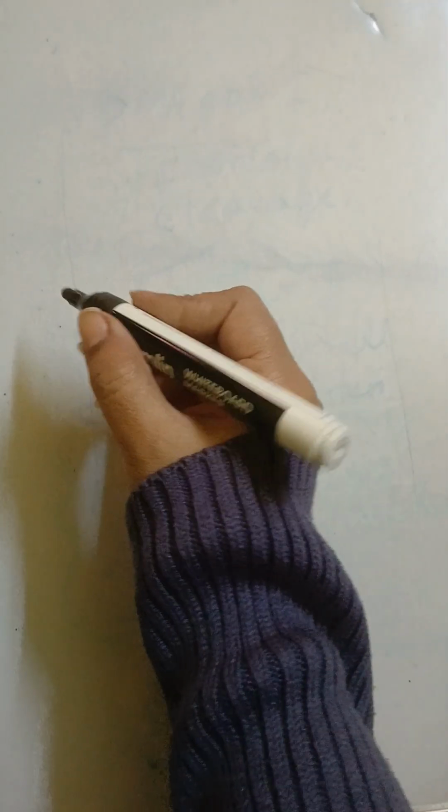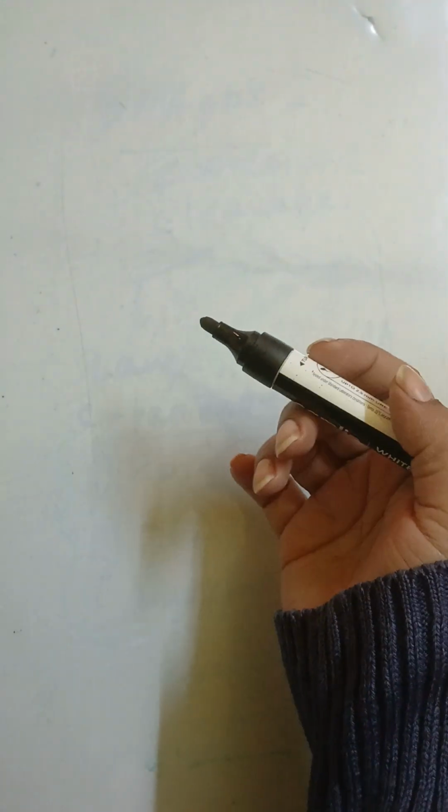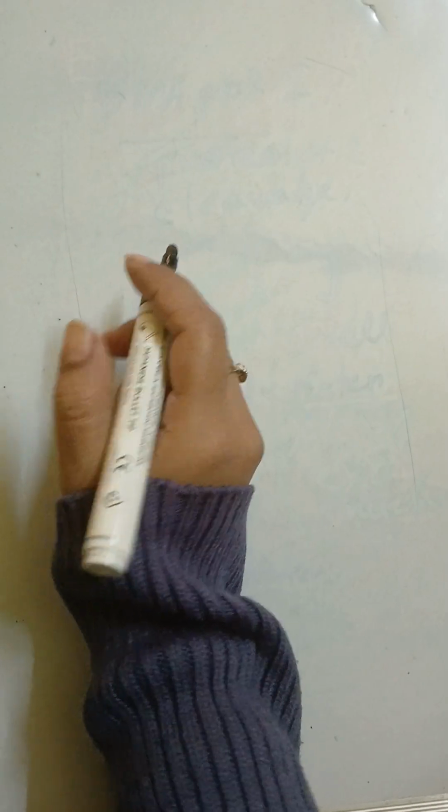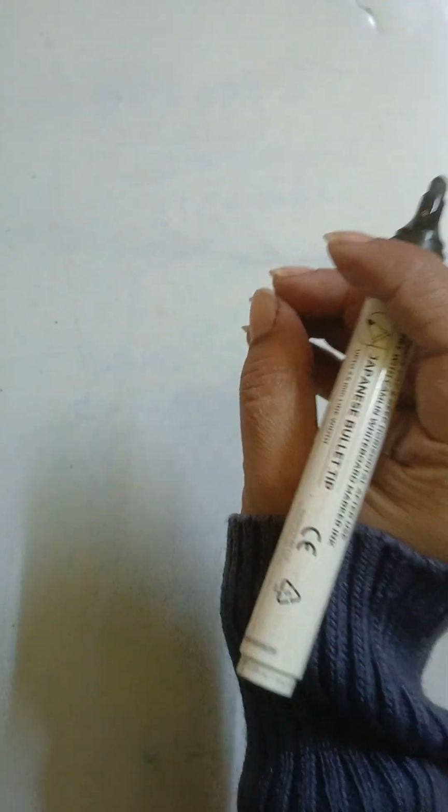Hi all, in this video I'll be talking about the whole process of the Sanger sequencing method. First we will start with the reaction mixture the sequencing method needs.